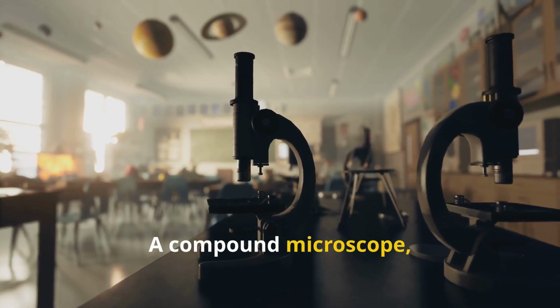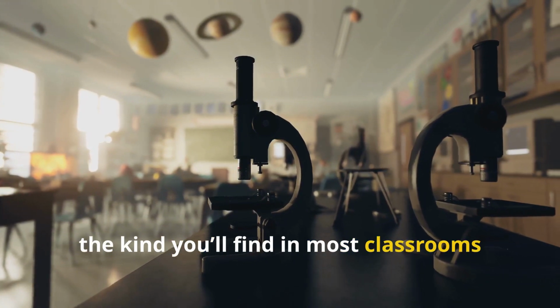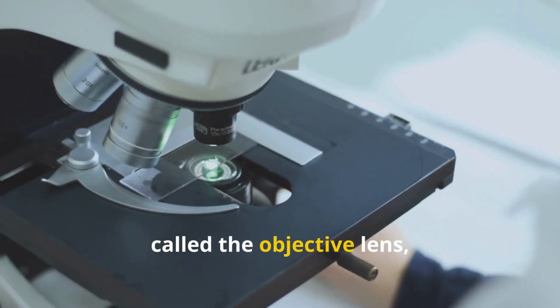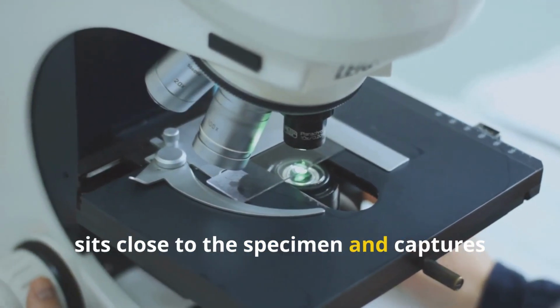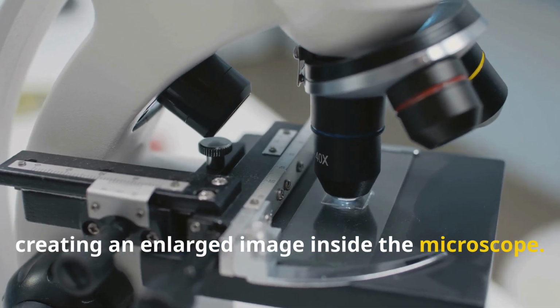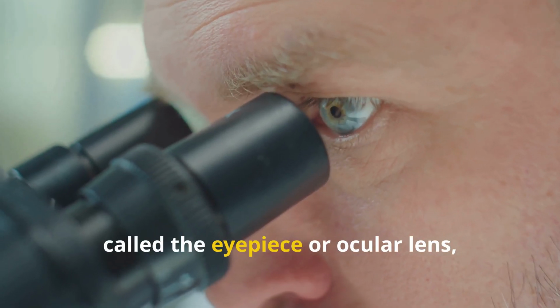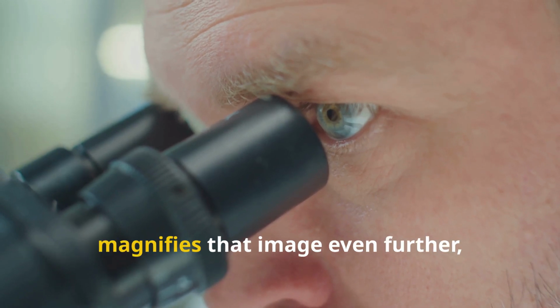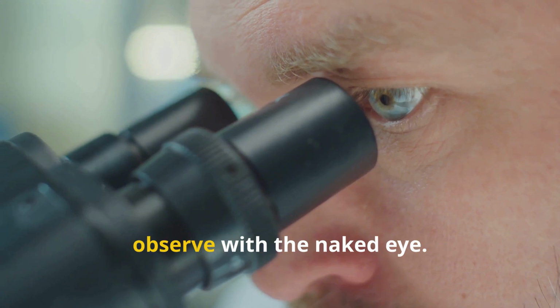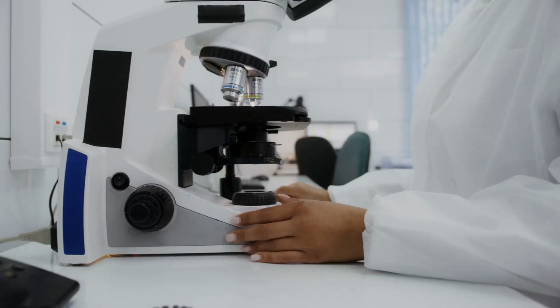A compound microscope, the kind you'll find in most classrooms and labs, uses two main lenses. The first, called the objective lens, sits close to the specimen and captures the tiny details, creating an enlarged image inside the microscope. The second, called the eyepiece or ocular lens, magnifies that image even further, allowing us to see details we could never observe with the naked eye.